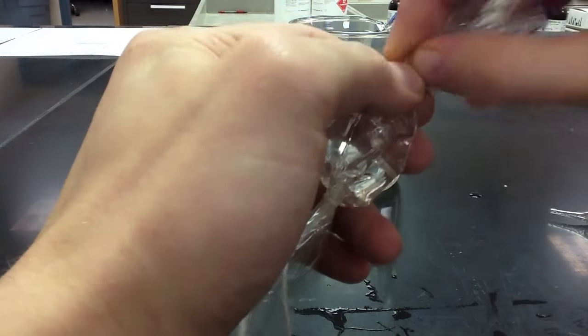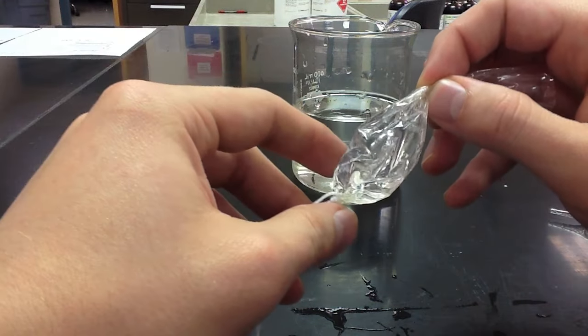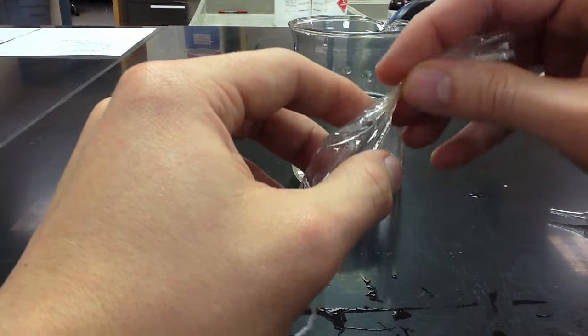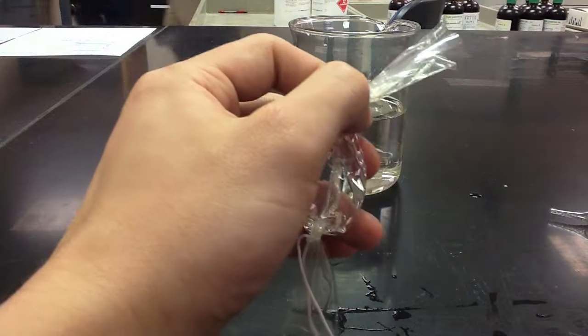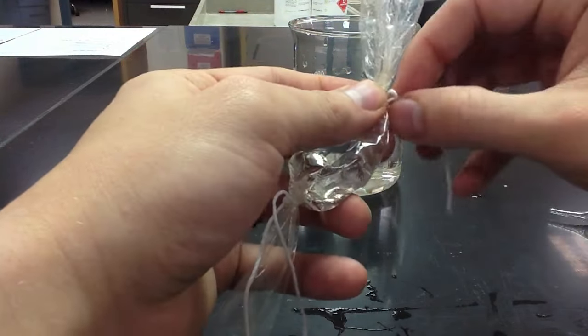Once this is done, you'll take the second piece of string, you will wrap the second end of the bag in that piece of string and secure it tightly so that no liquid can leak out of this end of the bag either.